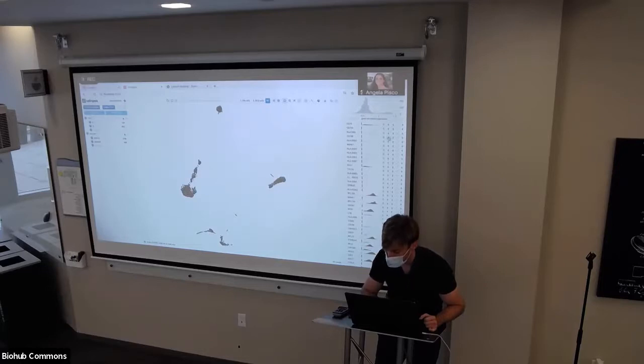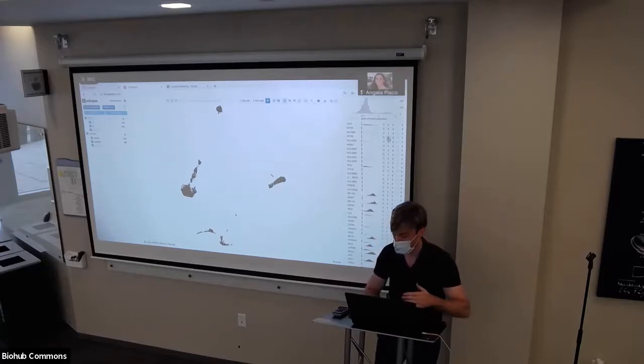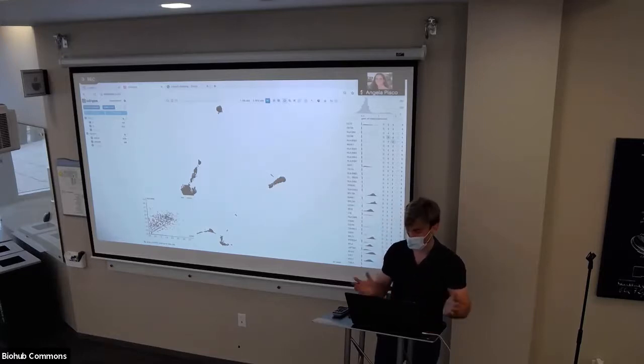So we'll hit the X. In this case, it's CD79B. There's a little X there that we hit. This is going to say we want this to be on the X-axis, and then we hit a Y on another gene. And then at the bottom, what shows up is a scatter plot of their expressions across the cells.